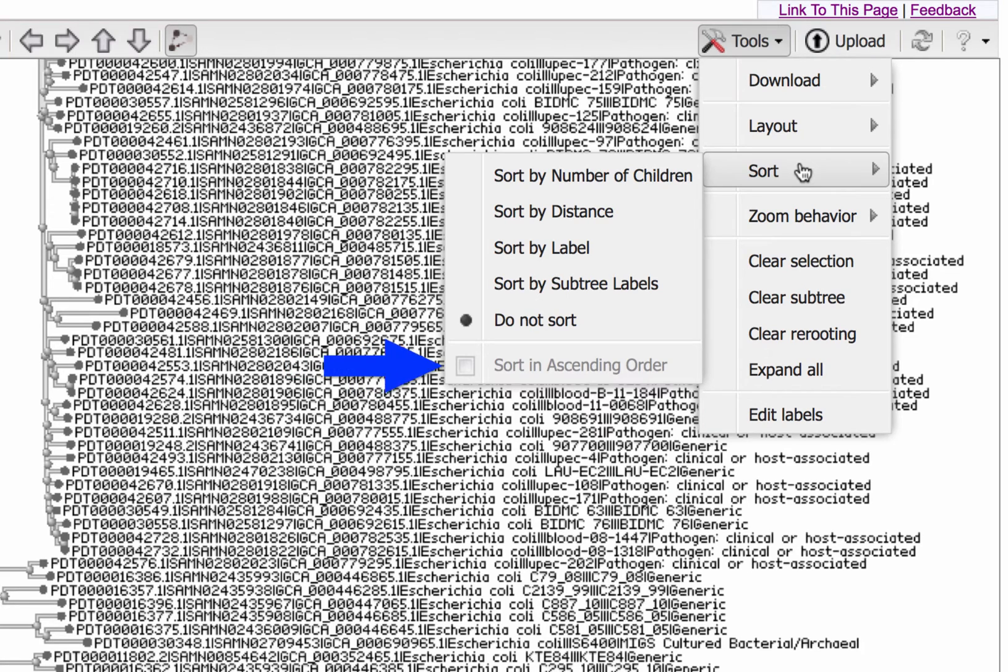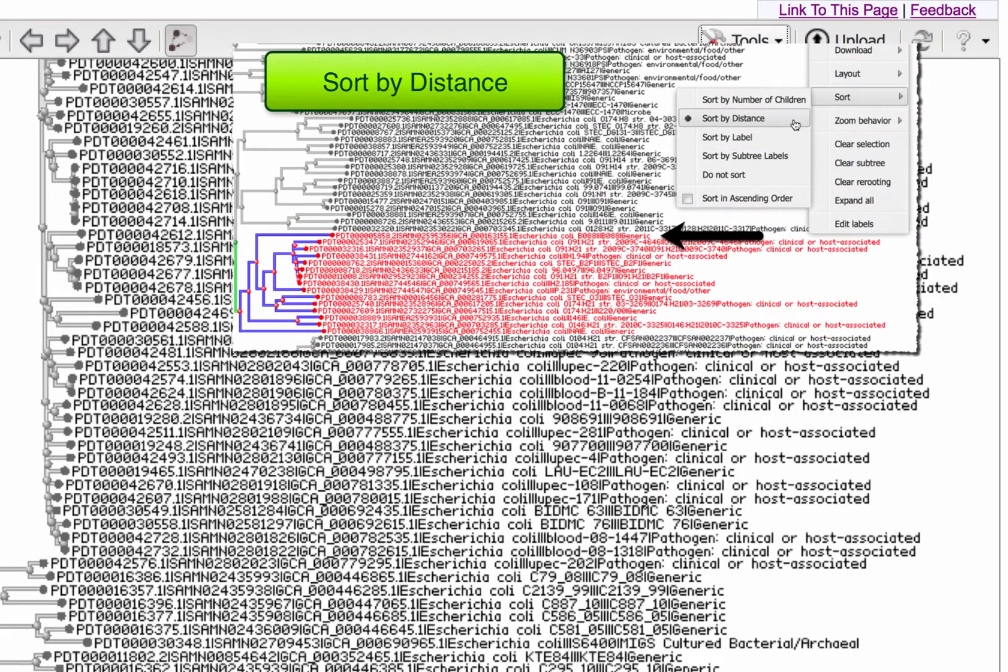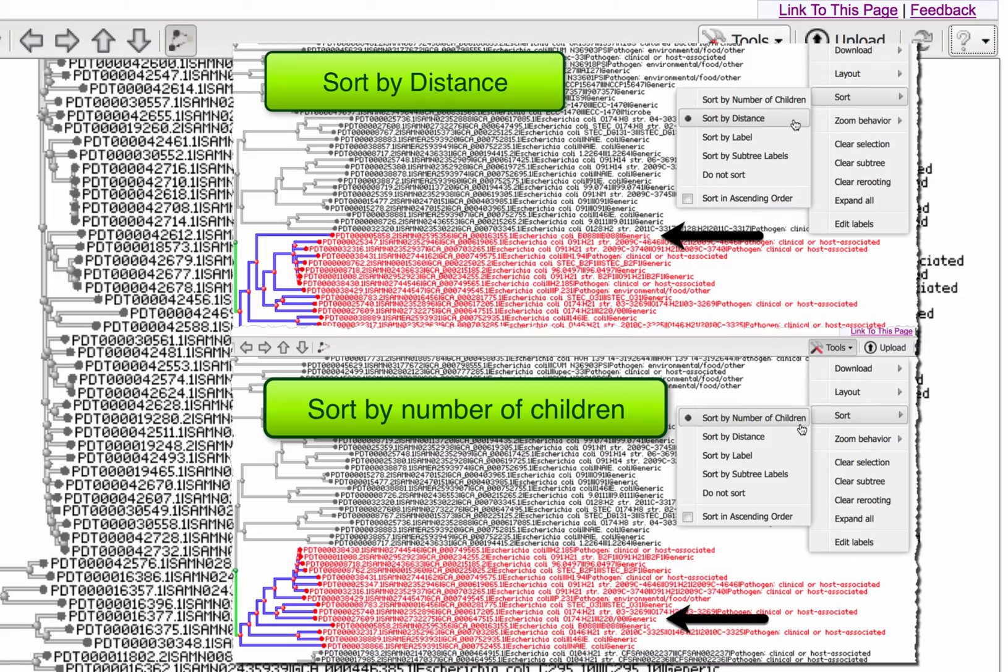And you can switch between descending, the default, and ascending order. These screenshots show you an example of distance sorting versus sort by number of children. The black arrow simply indicates how the position of one sample changes.